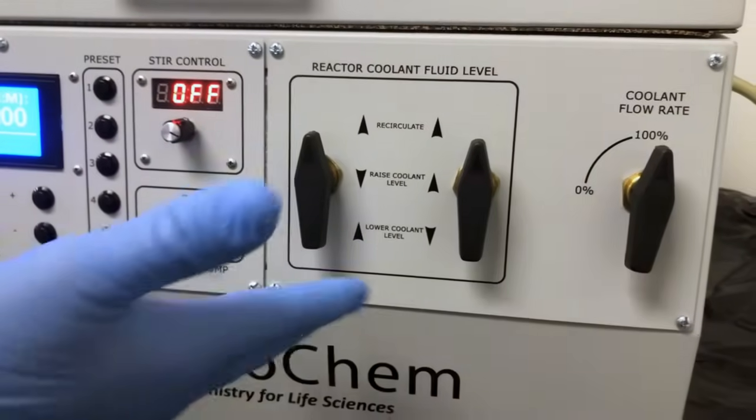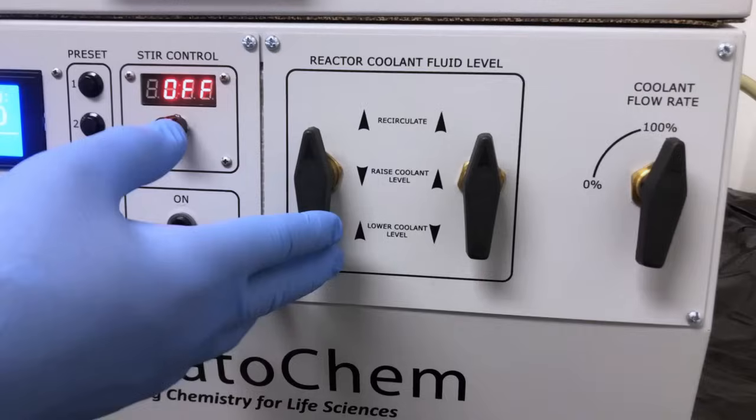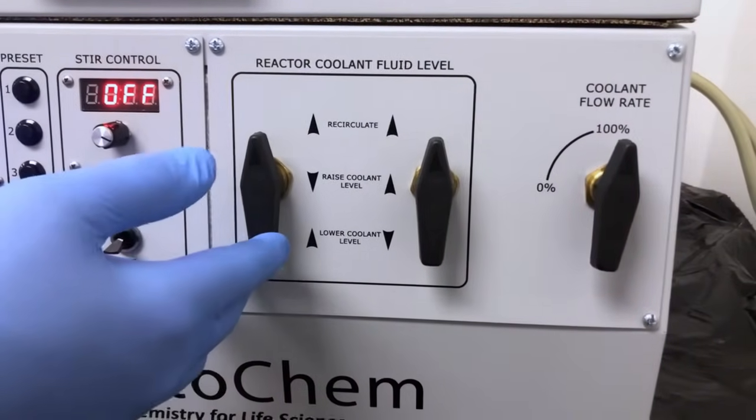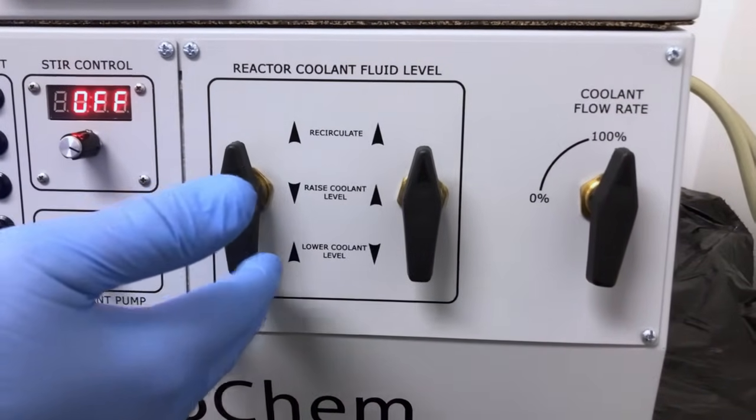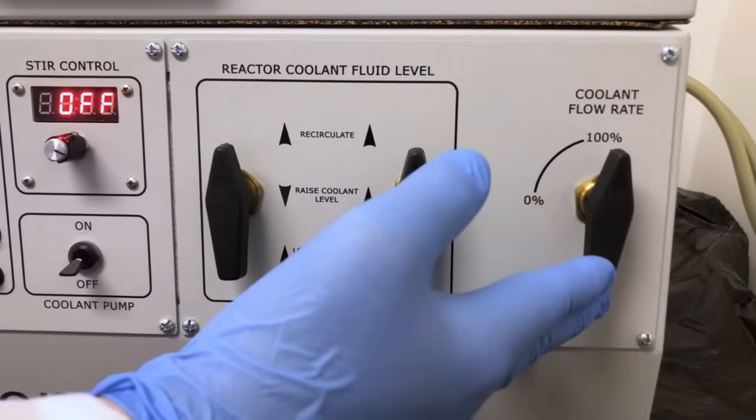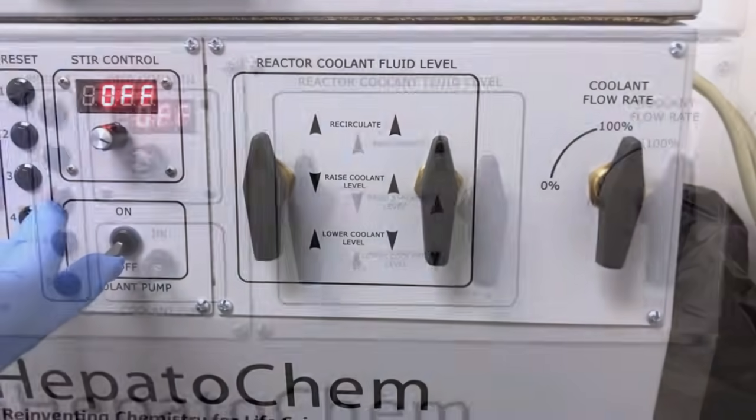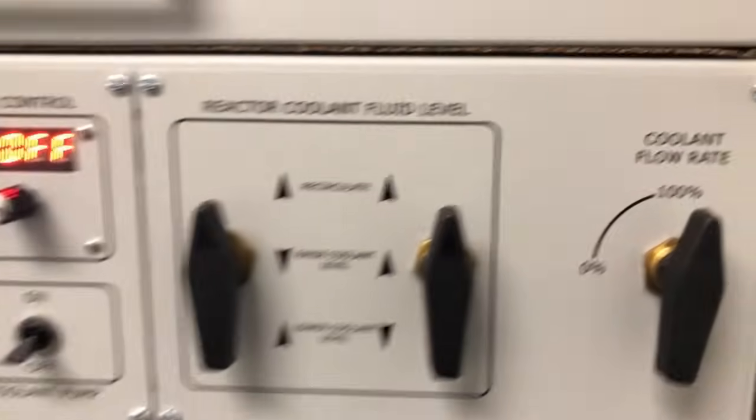The right side of the panel is dedicated to the operation of the Lucent360's integrated temperature control system. The reaction coolant valves enable precise control over the fluid circulating through the reaction chamber with a separate lever to control the flow rate. Peeking along the right side of the machine, you can see the connection ports to the heater chiller.